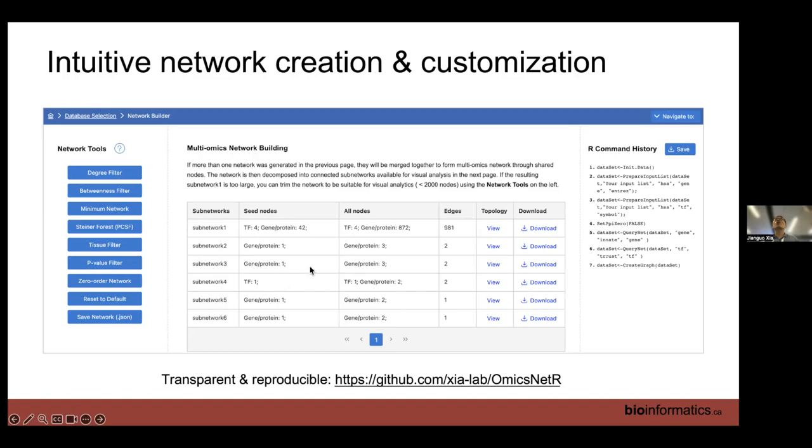And this is all well established, acceptable. And you get a lot of the networks. And most times the network we are going to find is one big continent, and most of the genes and metabolites of interest will be concentrated on that. Then there are a lot of small satellite or orphaned nodes like that.